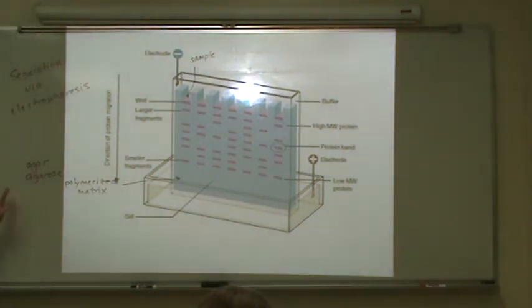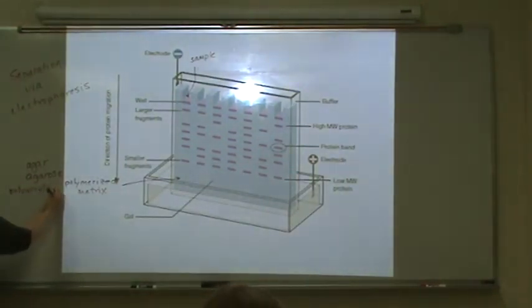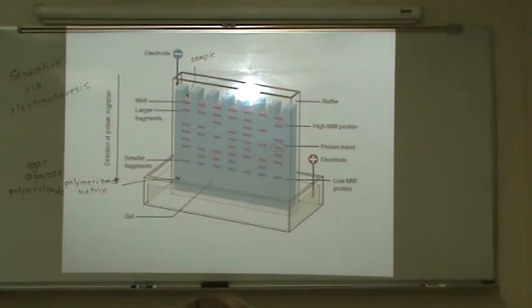Nobody uses that anymore. And polyacrylamide. Those are the major ones. Agarose is normally used for DNA.